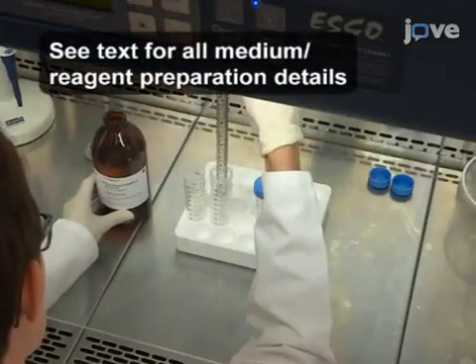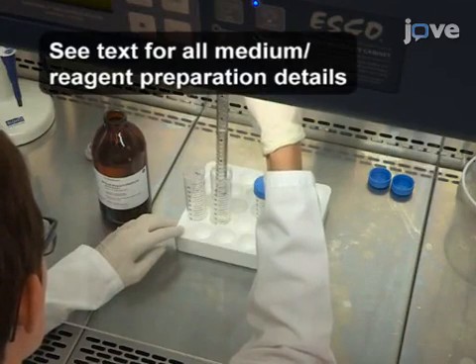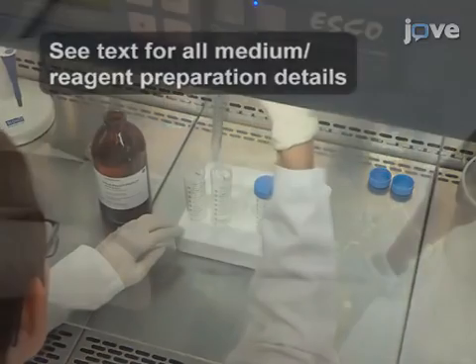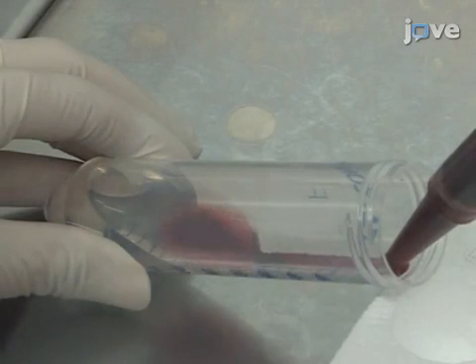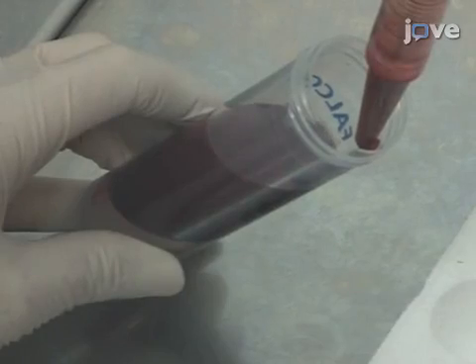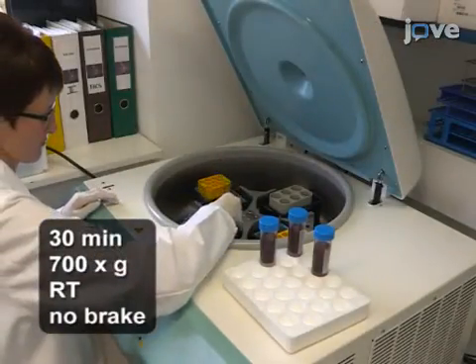Next, add 15 milliliters of density gradient medium to each of four 50 milliliter conical tubes and, pipetting slowly and carefully, overlay 25 milliliters of pooled blood cells onto the density gradient in each tube. Separate the cells by centrifugation.